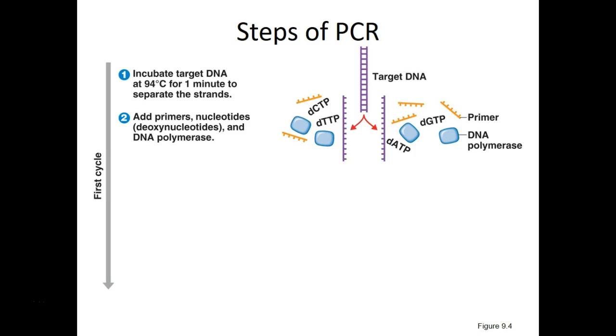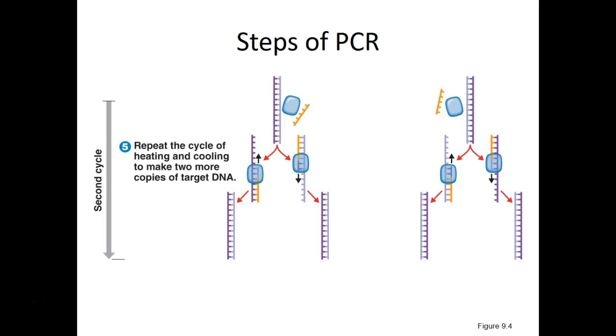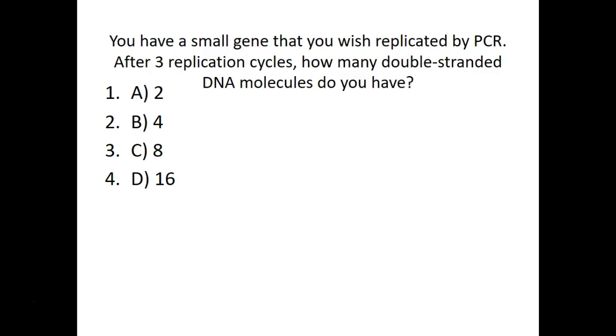All right, so heat the DNA, get the polymerase to copy from the site of the bound primers, and after 3 replications, you heat and cool 3 times. You start with 1 piece of DNA.